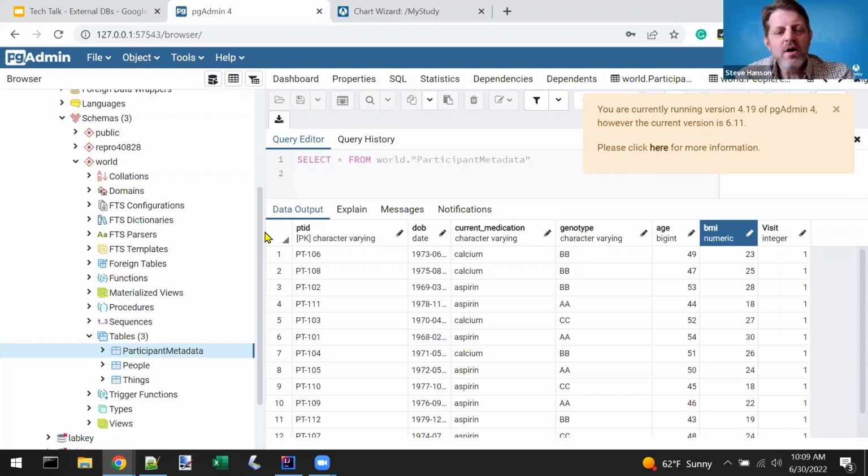So you can absolutely filter that data on import. Also, does the query metadata have a place for applying filters? No. But like you said, you could create a view in the remote database, and that looks like a table to us. Or now you get into linked filtered schemas: you can connect your external database in one place, called my external schemas in one folder, and then use linked filtered schemas to expose subsets of that to different people. Great, those are great ideas.